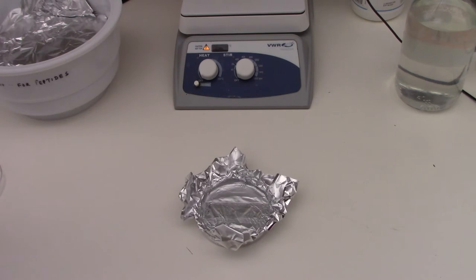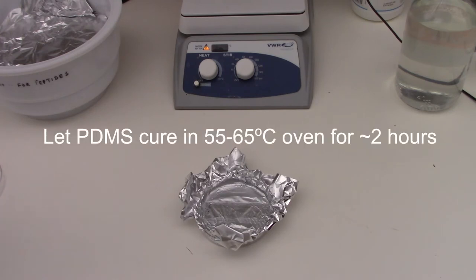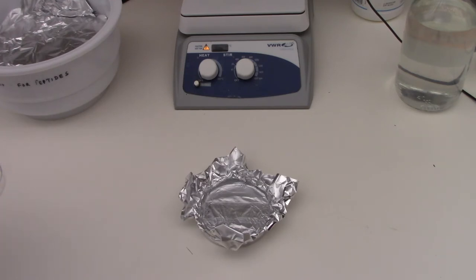And then last but not least, we'll just put this in the oven between 55 to 65 degrees Celsius for about two hours. If you have a 3D printed mold, check the temperature limits of that 3D printed plastic because you may have to use a lower temperature.